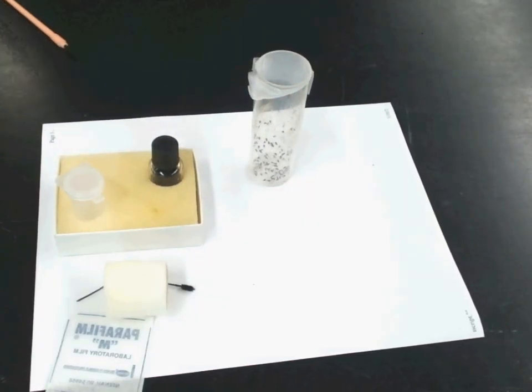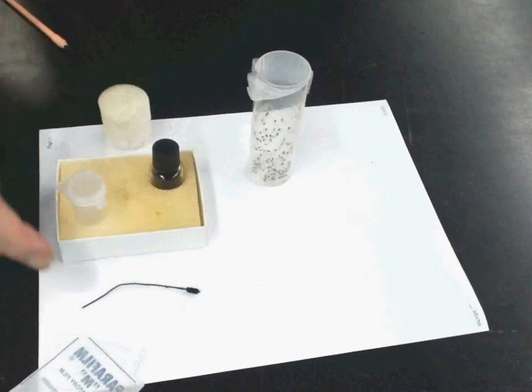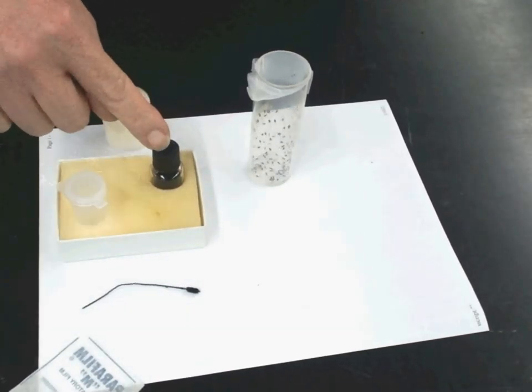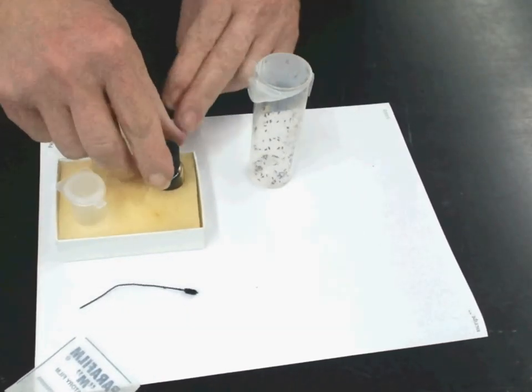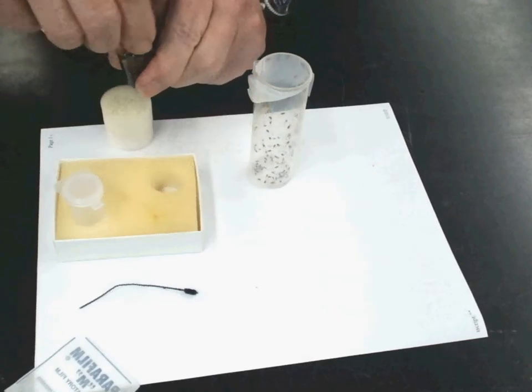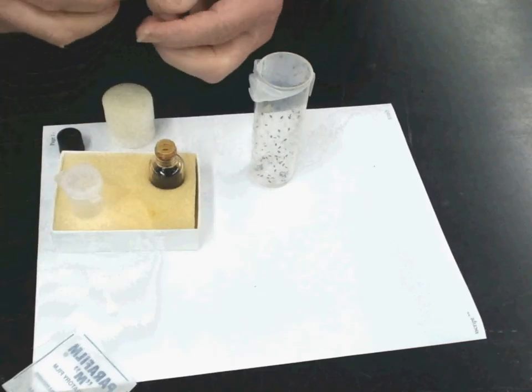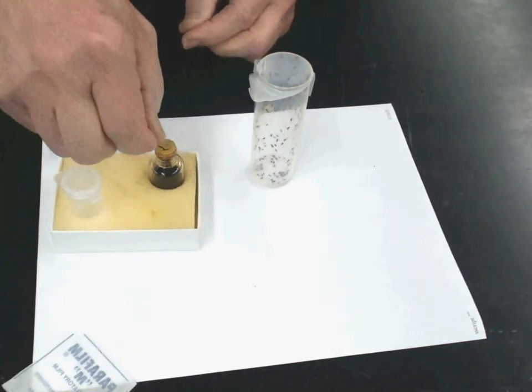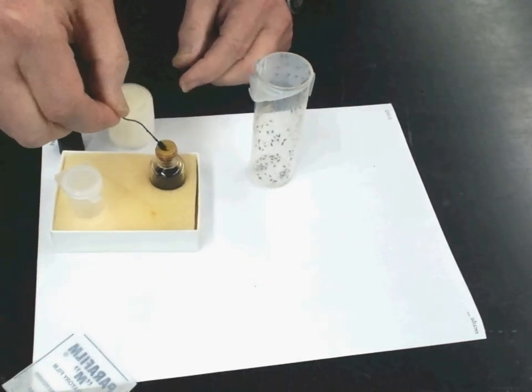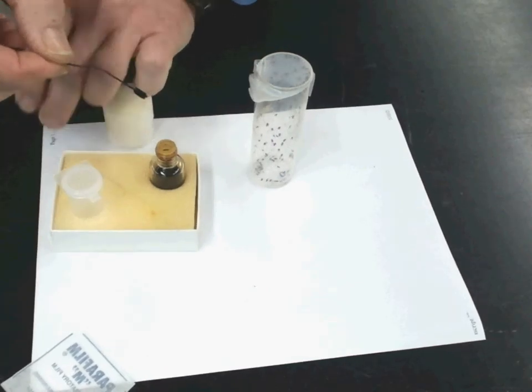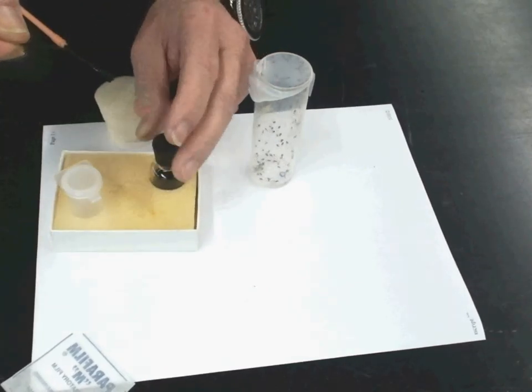Now you're going to want to load the wand with the anesthetization fluid. Open the fluid up and dip the wand in. Just one dip, not too much on there. Close it up because the stuff has a smell.